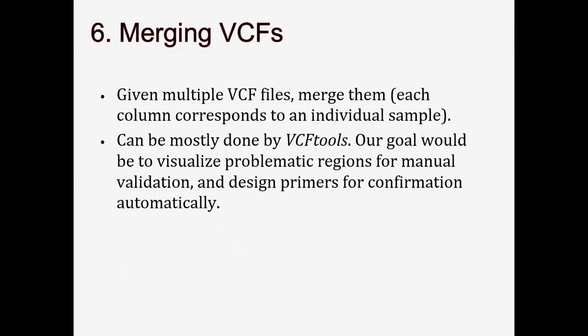Because sometimes the data generated from each and every individual sample will be different. So call the VCFs separately and then merge them afterwards. This can mostly be done by VCFtools. Then in this merged VCF file, the goal would be to visualize the problematic regions for manual validation and design primers for the confirmation.